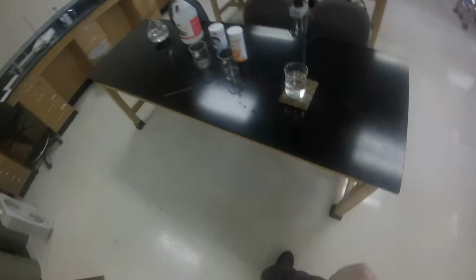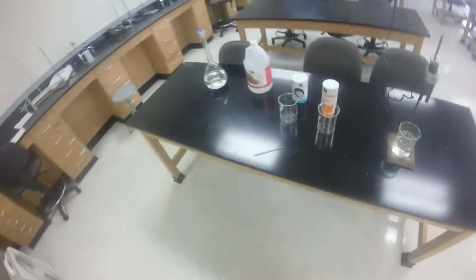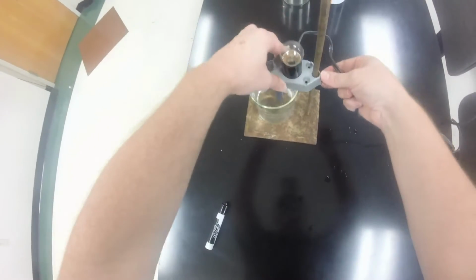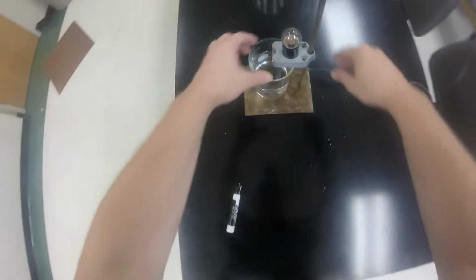The classic demonstration for looking at whether a solution is a strong, weak, or non-electrolyte is one of these: if we can actually conduct electricity through that. So here we have a beaker full of distilled water. We have our light bulb, which is connected to our power supply, and then we have these electrodes we can drop in. So in pure water without any other substances in it, if we just drop this bulb in, we will see the light bulb stays out. There's no charge carriers in that aqueous solution to carry the charge between these two electrodes to allow the current to flow through the filament in the bulb, so the bulb does not light up.